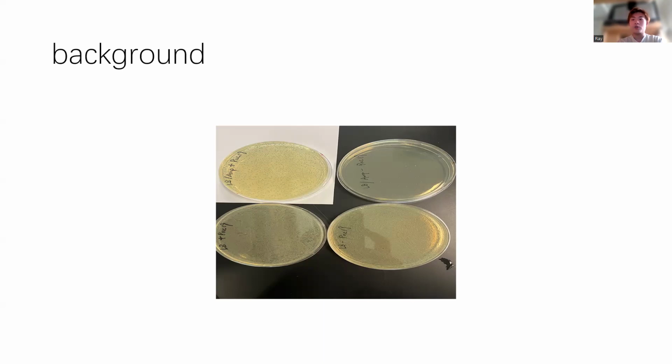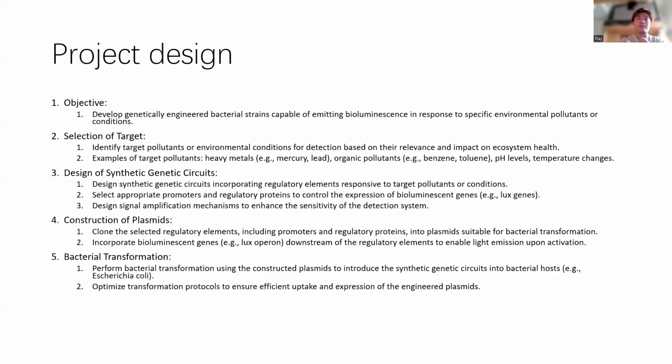There was evident blue coloration in the LB-AMP condition. Conversely, in the minus plasmid condition, where competent E. coli bacteria were plated without any plasmid, we noted a dense bacterial lawn on LB agar plates, while no growth was observed on the LB-AMP agar plates.